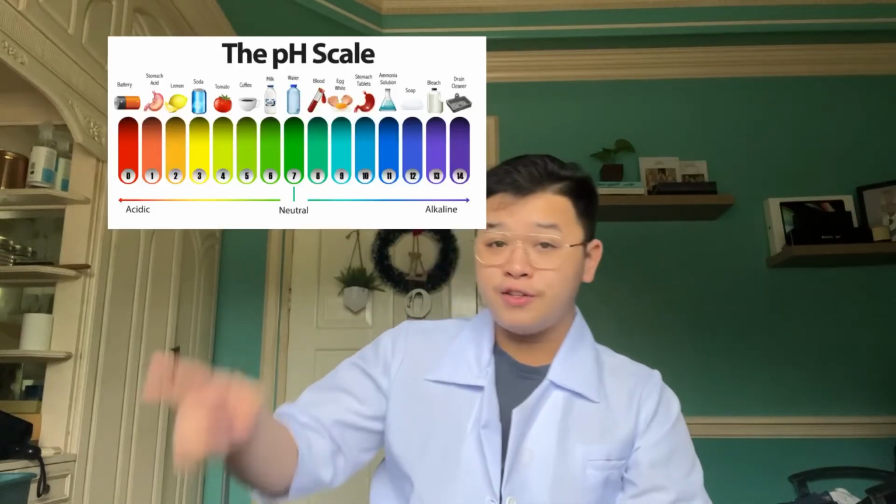The anthocyanin indicator turns red-pink in acidic solutions, reddish-purple in neutral solutions, and green to blue for basic or alkaline solutions. Due to the fact that only one natural pH indicator is used, the indicator is yellowish in acidic solutions and also yellowish in basic and neutral solutions. Now, to determine the order of our samples, we refer to this image.